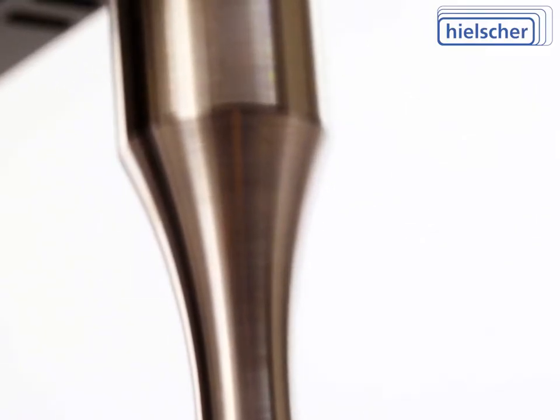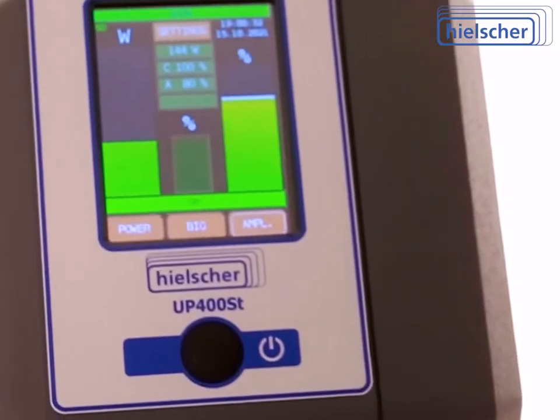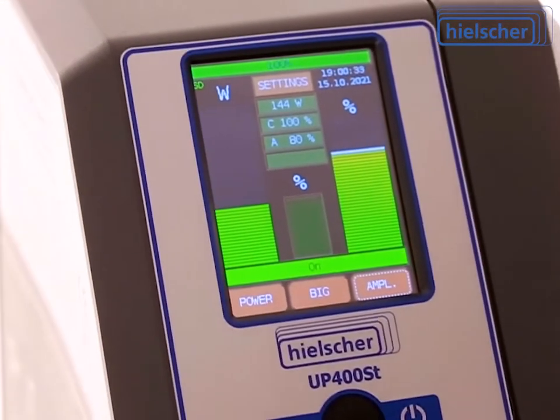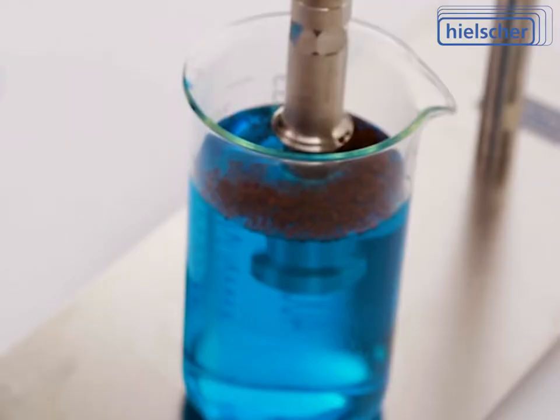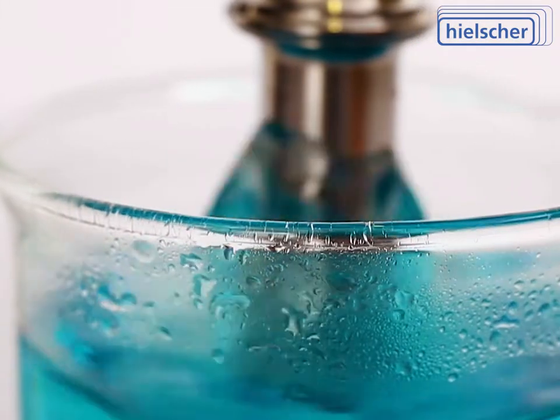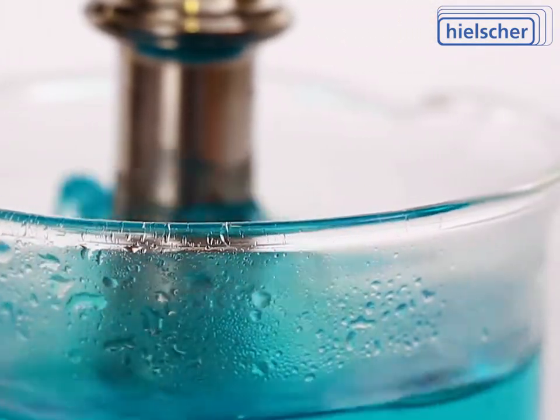There is a protocol for every sonication run containing amplitude, time, power, net energy, total energy, and temperature. This improves reproducibility, quality monitoring, and certification of your process. This data also helps you optimize your sonication process together with our technical team.